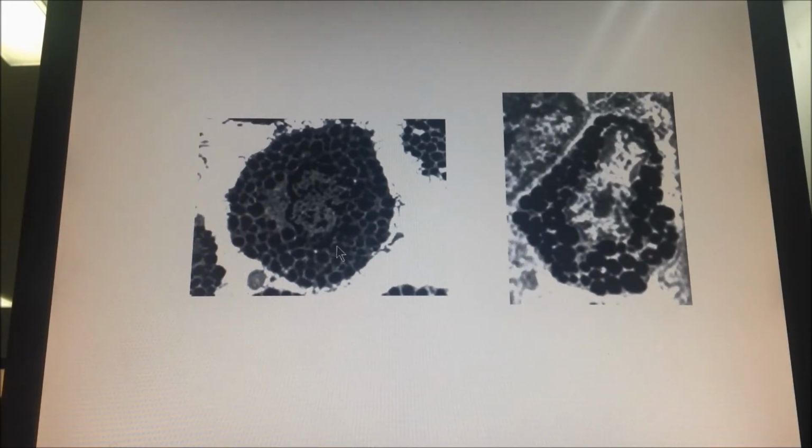الماست cell عددها قليل بالconnective tissue مش كتير. والجرانيولز اللي موجودين فيها هدول الالكترون دنس جرانيولز هدول شو بيحتووا؟ شو وظيفة الماست سيل؟ هدول الجرانيولز فيهم كيميكال ميدياترز بيطلعوا وقت الانفلاميشن. سمعتوا بالهستامين؟ هذا الخلية which produce histamine موجود inside these granules بالإضافة لـ other mediators زي الهيبارين etc. البروستاجلاندين والليكوترين whatever. كلياته بيطلع during inflammation.